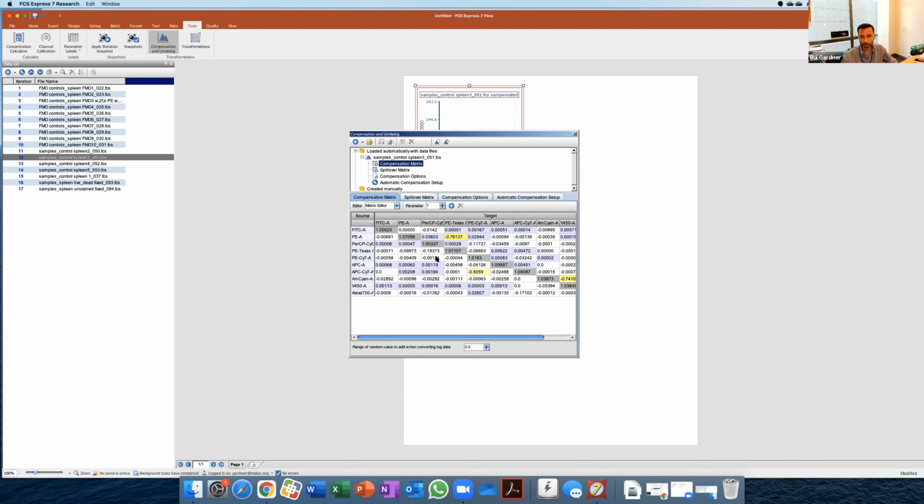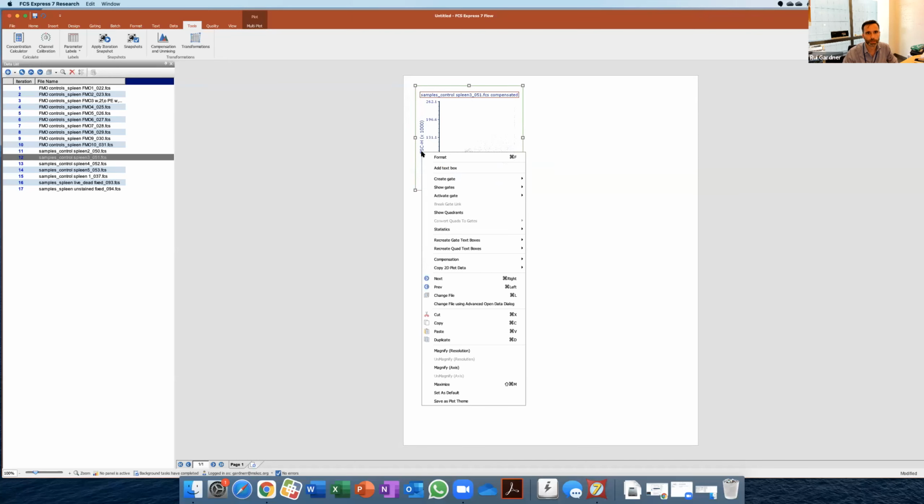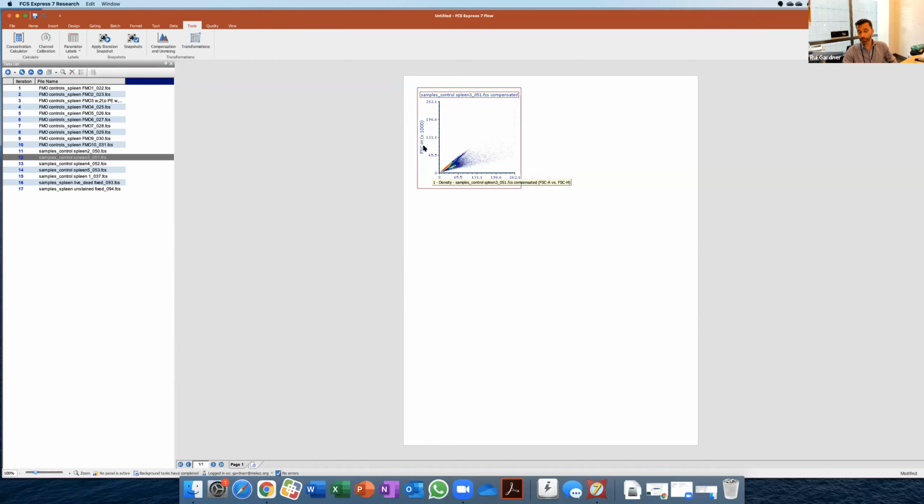We shouldn't be able to tweak them. That's a different thing, like I just did here. But anyway, I'll actually show you a case where it's obvious that you could really mess up your data by tweaking compensation by hand. Okay, so let's start doing the analysis now.